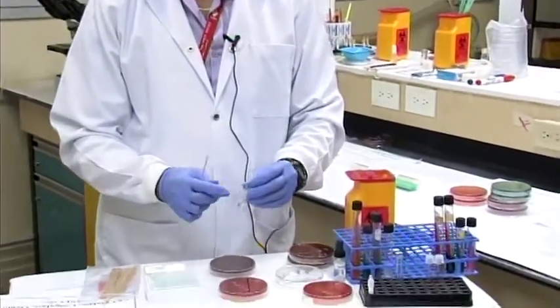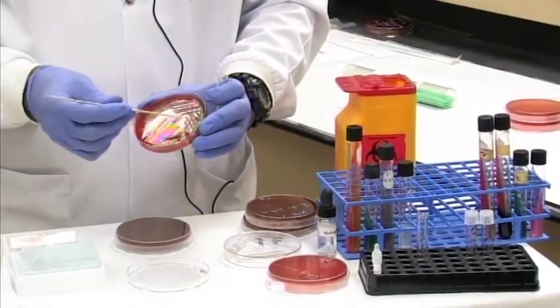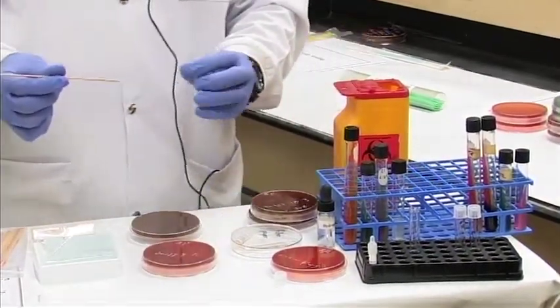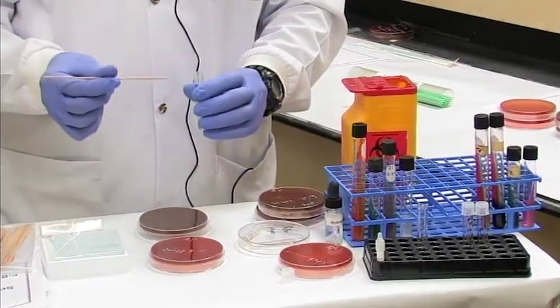So again, we're going to take our hydrogen peroxide into our tube. Then we're going to pick up some bacteria of the Streptococcus species. Now one has to be careful when picking up the bacteria from a blood agar plate because some red cells will have the enzyme catalase. So when you pick up the bacteria, make sure you don't scrape the agar as well.